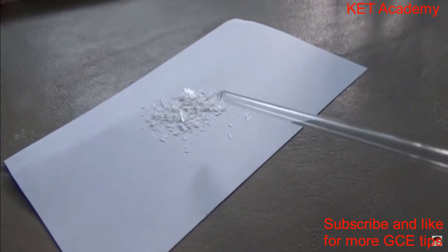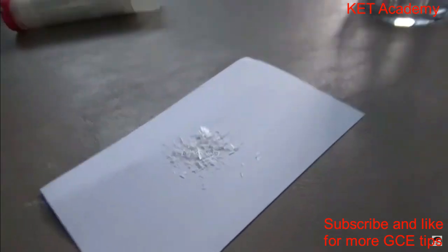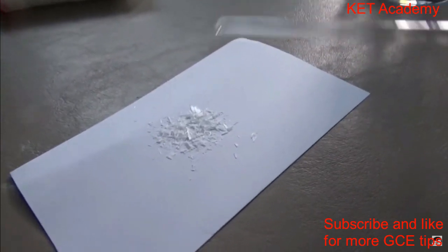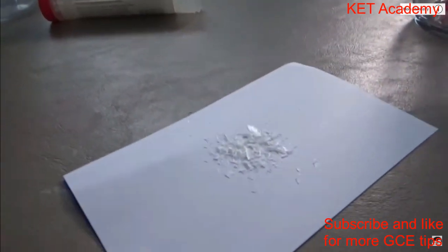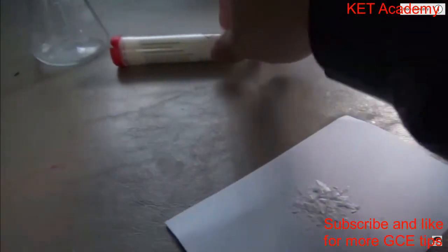Those are my two guesses right now. I'm actually leaning towards the potassium hydroxide because of the chemical reaction that these underwent. So those are my two guesses, and we shall test the hypothesis, see if it's right. First thing I want to do is test for carbonates, and that will require a lime water solution.